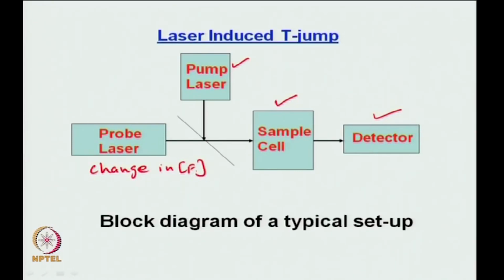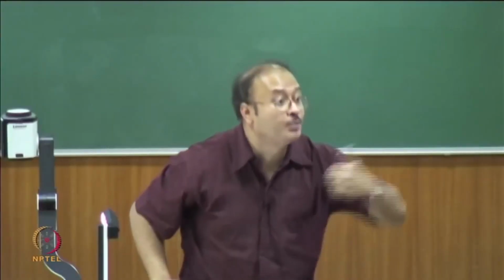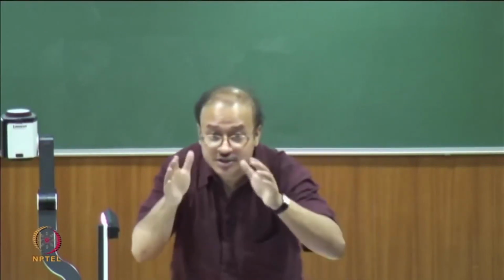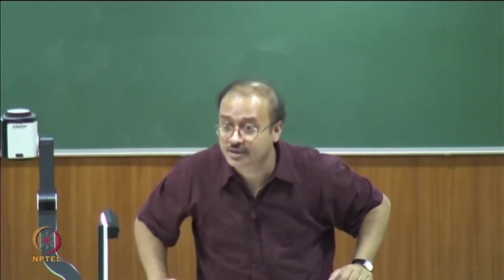Just hold on, I will tell you in clearer terms what is the difference between the pump and the probe laser. It is actually very interesting. Okay. So, do you understand now the difference between a pump and a probe laser? The pump laser helps you increase the temperature, that is it. It does not help you detect. The probe laser comes in because you are now probing. So, the pump is pumping in energy, increasing the temperature. The probe laser, as the name suggests, is helping you probe the change in spectroscopic signal. That is why it is called a probe laser.